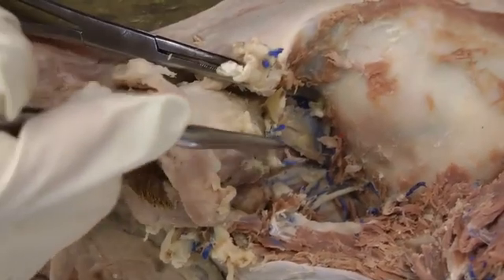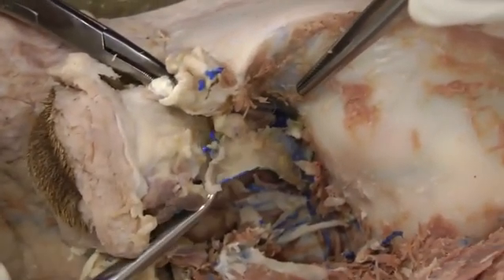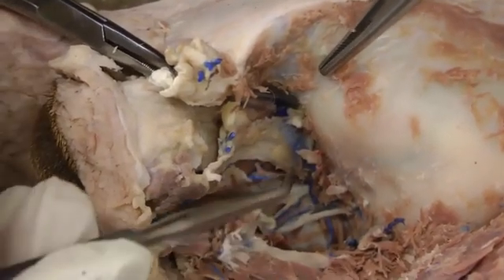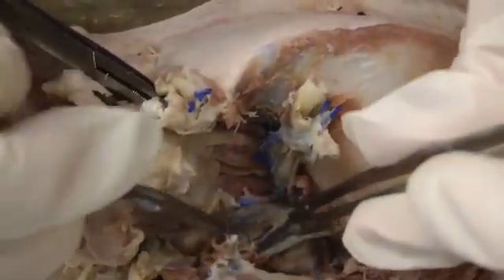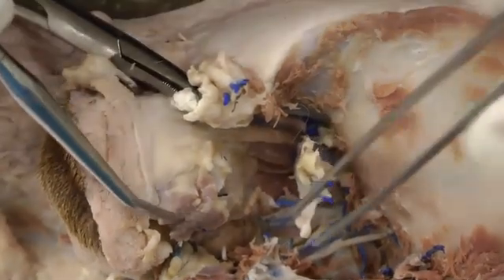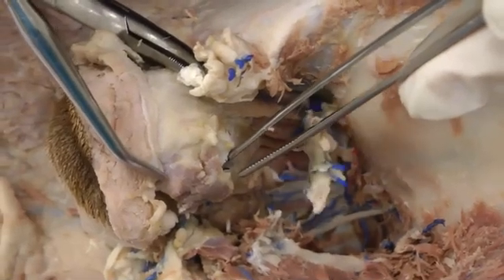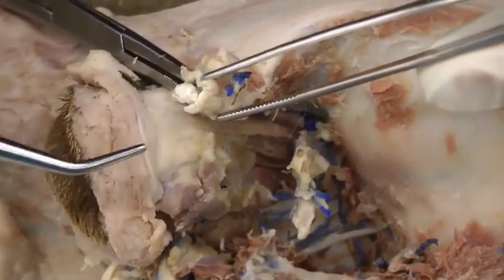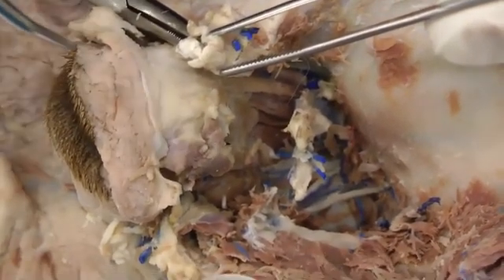In here you're looking for the periorbita, which is a whitish-yellow sheath of connective tissue that covers all of the eye muscles we're going to look at. You want to incise that and then reflect it — it's just a sheet of tissue. We also have the lacrimal gland, a flat lobular structure sitting underneath the orbital ligament you reflected, so be careful and watch for it when you reflect that.